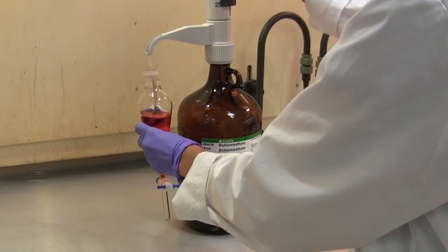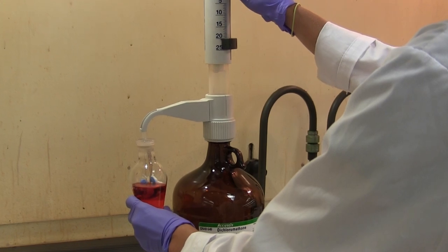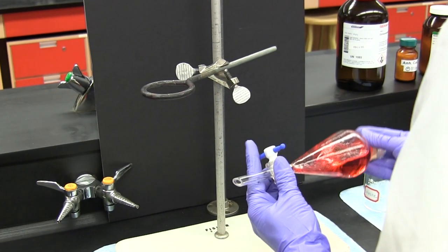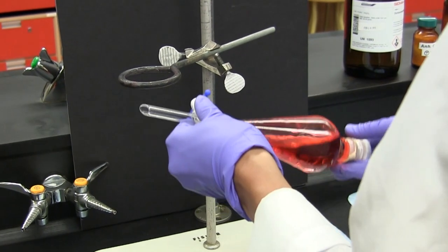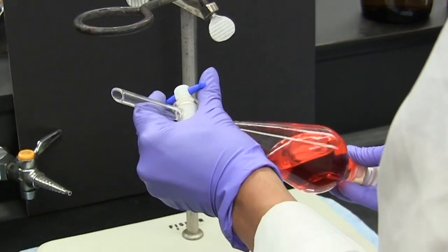A compound can be selectively separated from other compounds or impurities in a solution by extracting it from the original solvent into another solvent. This procedure is commonly referred to as a solvent extraction, or just extraction.